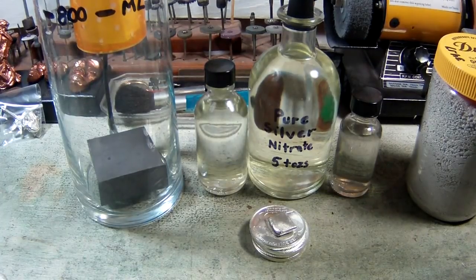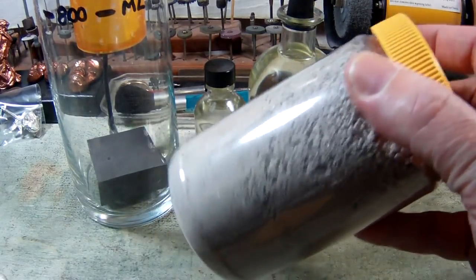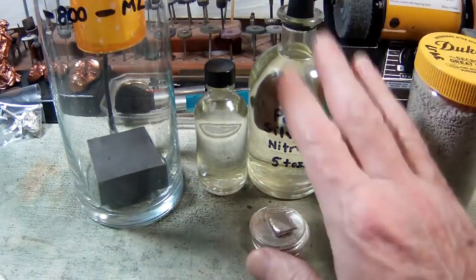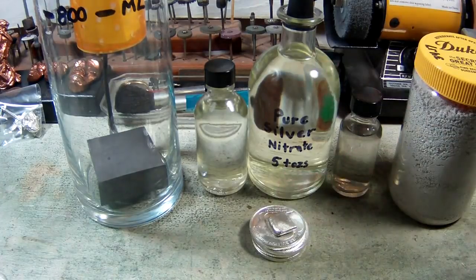So that's the first part — we made our silver nitrate. I did exactly what I normally do when I'm refining or making this silver powder. It's the same process, so I'm not going to go through that again. The only difference is this comes out clear and the other stuff is going to come out blue.